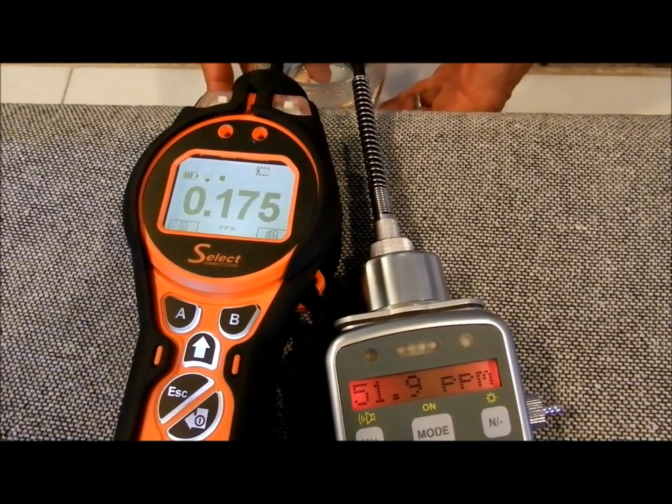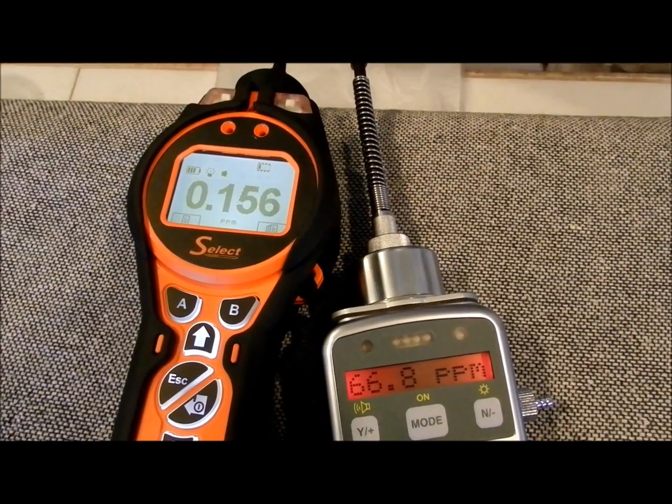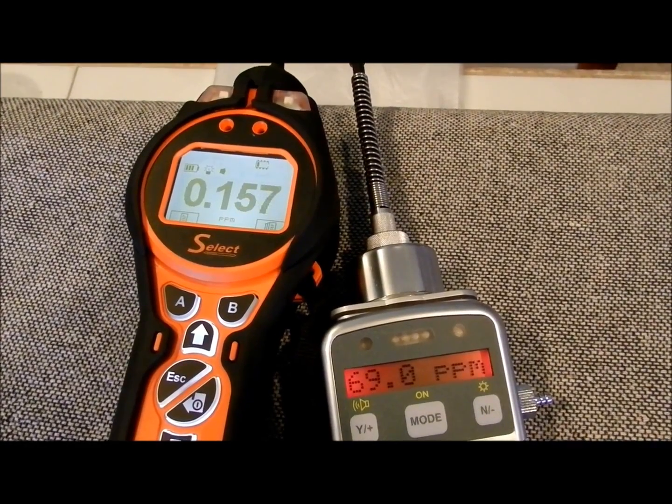And when the water is removed, there's a slight effect, but the recovery of the Tiger Select is much quicker.